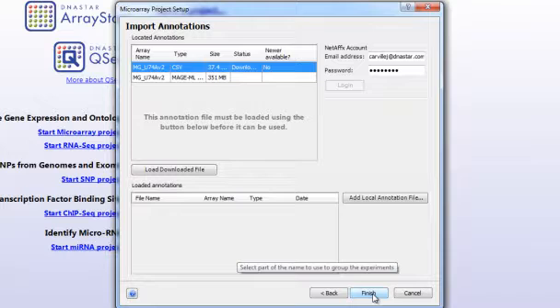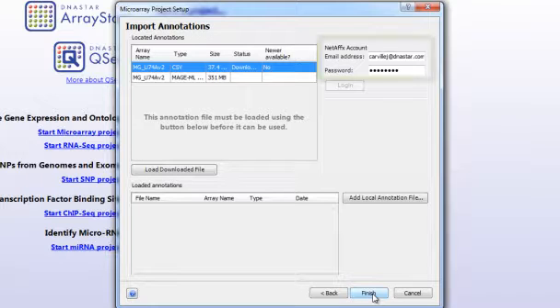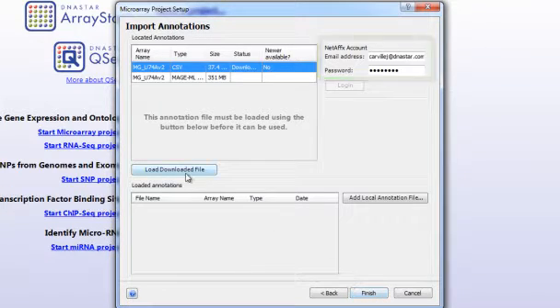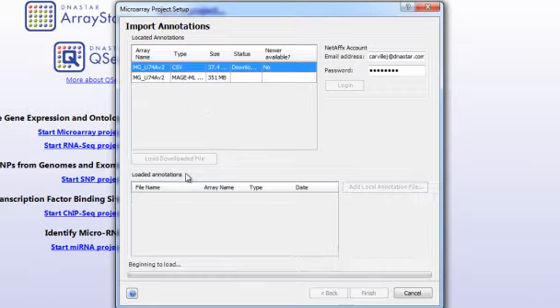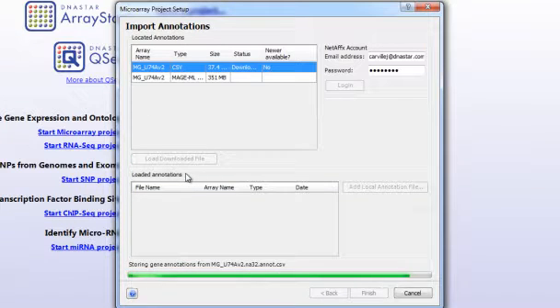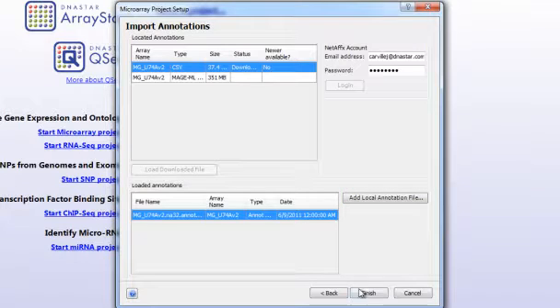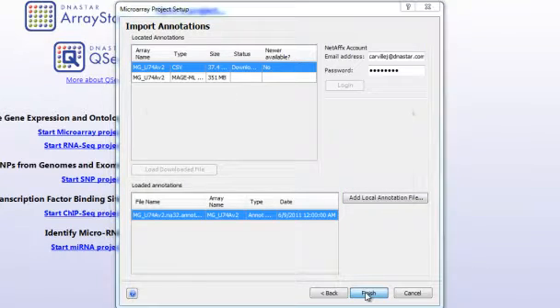You can then import annotation files into your project by either downloading annotations for your Affymetrix data through your NetAffx account, or by adding any local annotation files you have saved on your computer. Click Finish to load your data into ArrayStar.